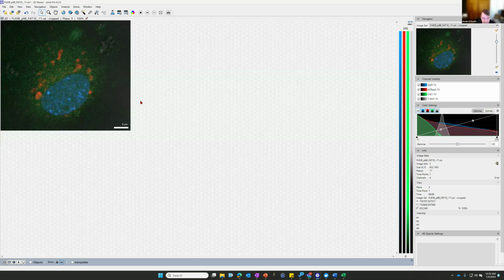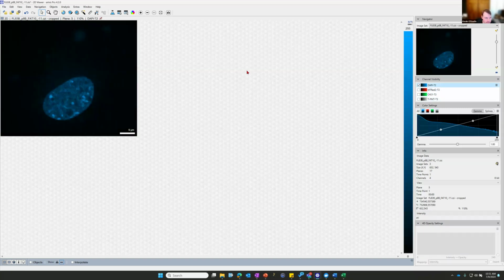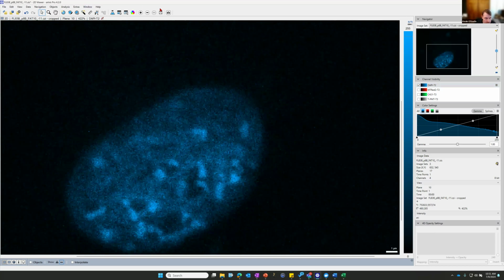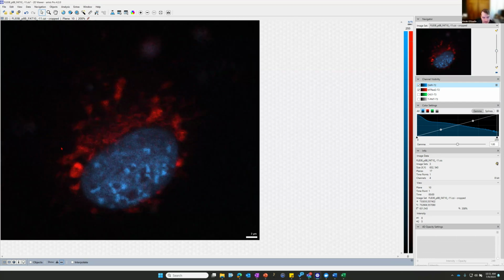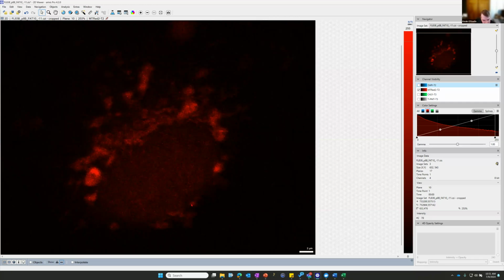So let's say I want to segment out some DAPI, maybe these brighter regions. And doing just an intensity-based operator is probably not going to give me the best result. Maybe I'll do something with this because there's a little bit more discrepancy. So let's say I want to segment out this little piece of it, but if I were to do an intensity threshold and chose to include this, then probably a lot of this other information would also be included, and it's just going to be a mess, right? You're only segmenting based on one feature, intensity.